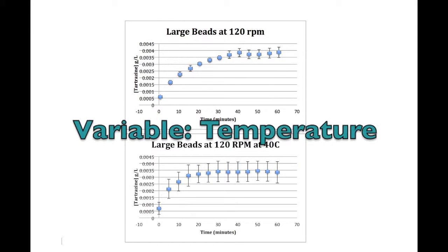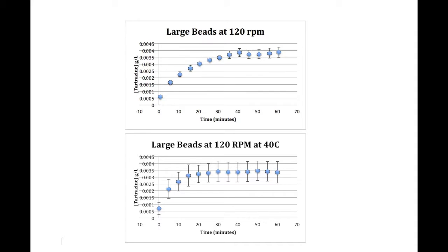The last variable we decided to test was temperature. Since we are exploring the phenomena of drug delivery, we decided to test the diffusion rate at 40 degrees Celsius, which is close to your natural body temperature of 37 degrees Celsius.